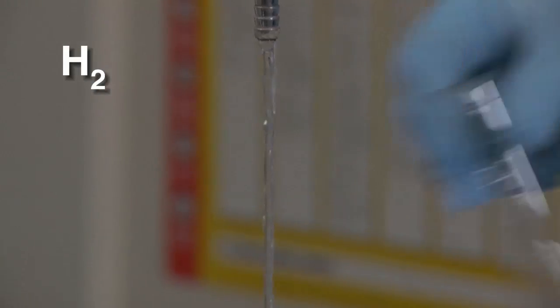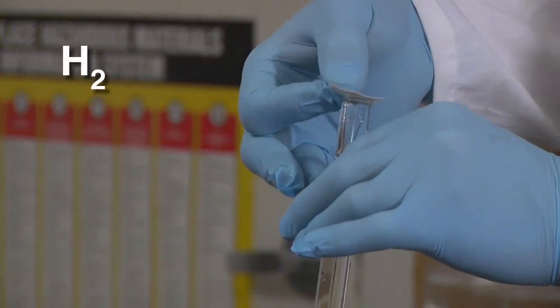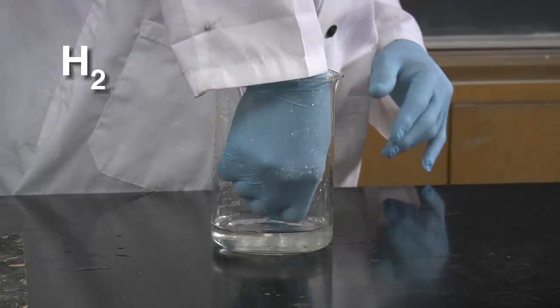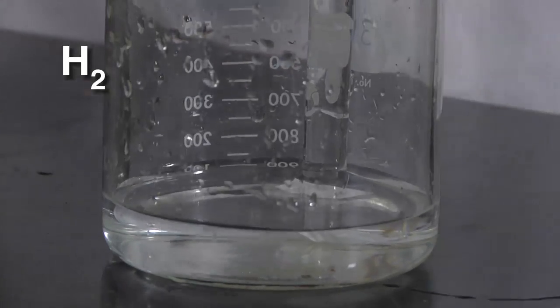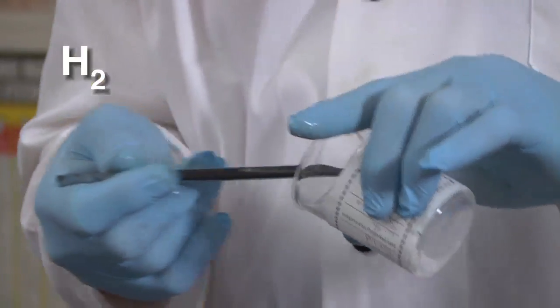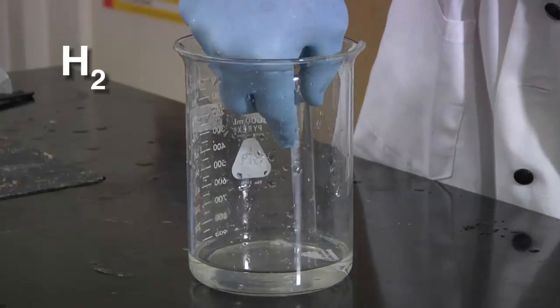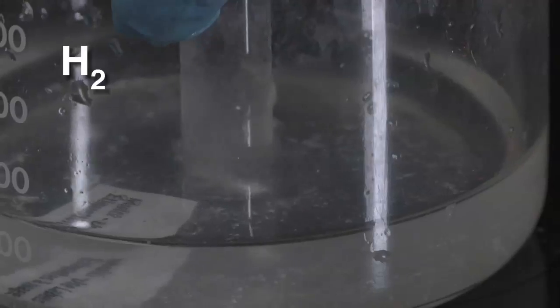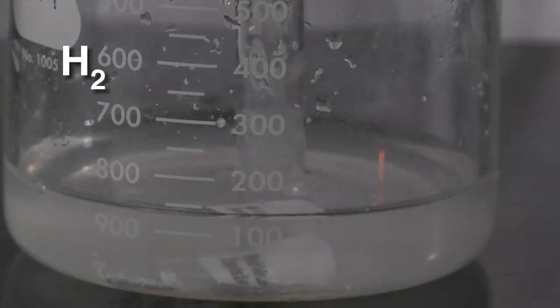Fill the test tube with tap water. Cover the top of the test tube with a small strip of paper or cardboard. Over the beaker, invert the test tube with the strip. Place the test tube in the water and remove the strip. Use a clean, dry spatula to lift some calcium pieces to drop in the water. Quickly move the test tube mouth over the calcium. Angle the test tube so that hydrogen gas can displace the water.